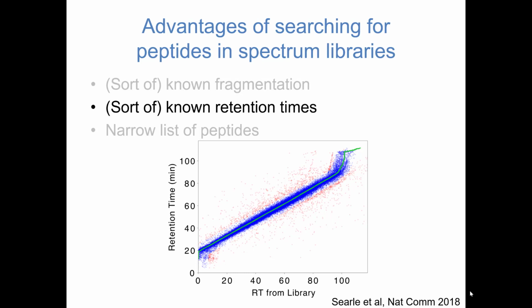That said, most people do some sort of a chemical fractionation to build libraries, right? And that chemical fractionation affects the matrix, right? So it actually changes when peptides elute as a result. And so even if you're running it on exactly the same instrumentation platform and the same column, because it has a different matrix background of peptides, it will actually shift around by a surprising amount, plus or minus 2 minutes. It's not as significant as this sort of thing is, but it is still much more variability than you would expect by default, right?